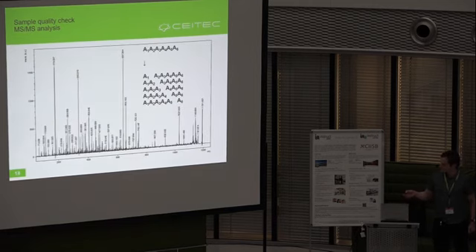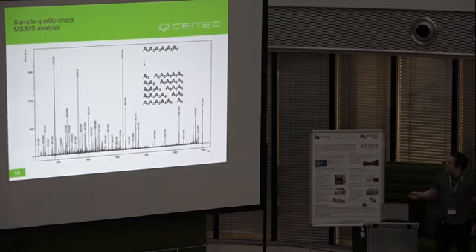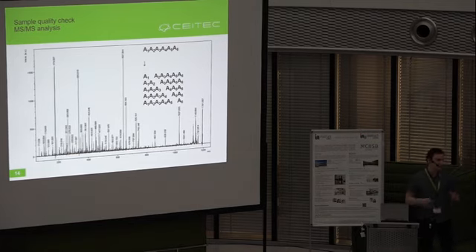Fortunately, during MS analysis, the peptidic bond gets fragmented. So from this model peptide composed of 6 amino acids, we obtained by fragmentation within the mass spec some shorter peptides which correspond to fragments containing either the C- or N-terminus of the peptide. And by simple mathematical calculations, you can find that the distances between the fragments we obtained by MS correspond to individual amino acids in the peptide sequence.